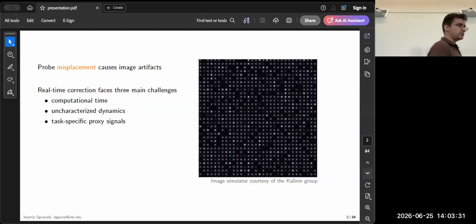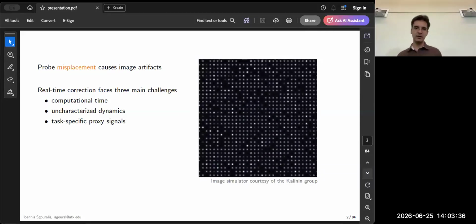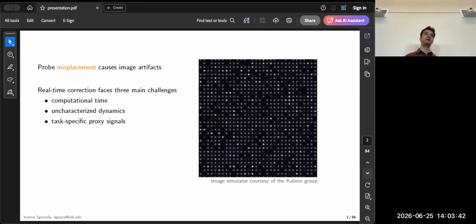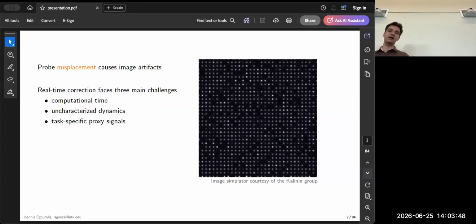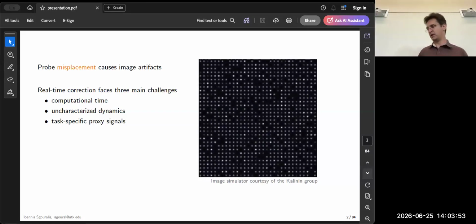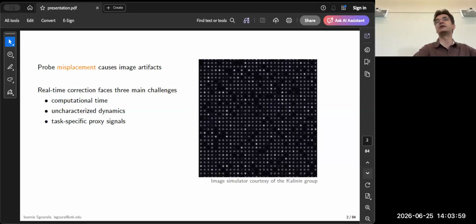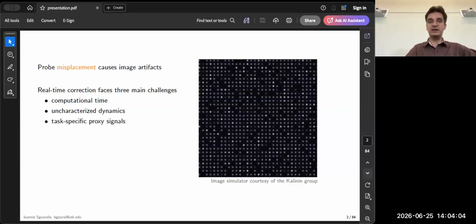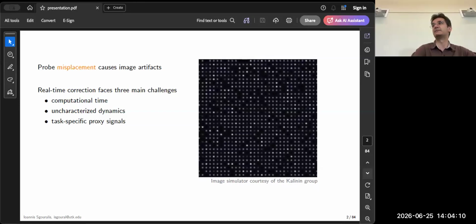So what I will try to illustrate today is start putting together a framework, mostly a conceptual framework, that we can use to instruct the microscope to sense what is happening in the images it currently acquires and try to correct itself. Ideally, in this case, to reduce the motion, to reduce the drift as much as possible. And before I get to the more technical part, I just want to mention from the very beginning that we are going to face three very important challenges.